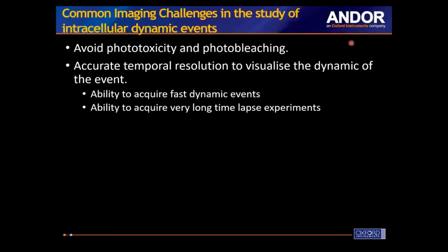While avoiding phototoxicity and photobleaching, researchers also need to acquire the images with enough temporal resolution to visualize the dynamics of the event they are studying, such as either a very fast dynamic event or a very long time-lapse experiment.